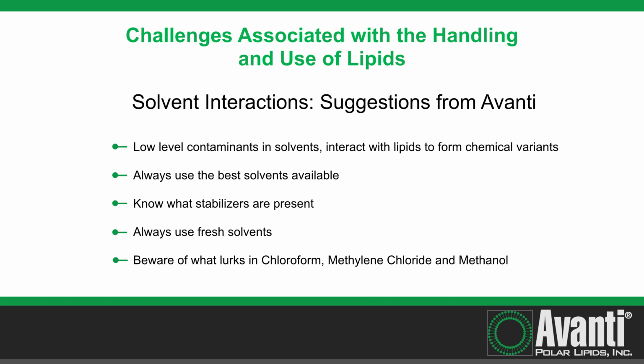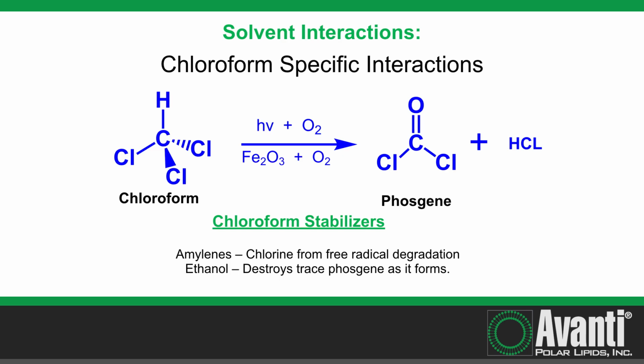I'm going to specifically talk about the problems which lurk in chloroform, methylene chloride, and methanol. Just to give you an example of what can happen, I think other interesting stories can be brought up for all of the solvents. I'm sure everyone is aware of the problems with working with diethyl ether, for example, forming peroxides. I'm not going to talk about that, but virtually all solvents have their own inherent problems. Okay, so here's the problem with chloroform.